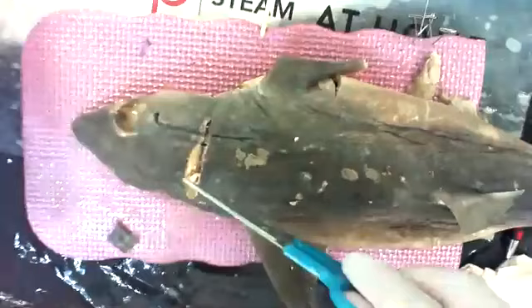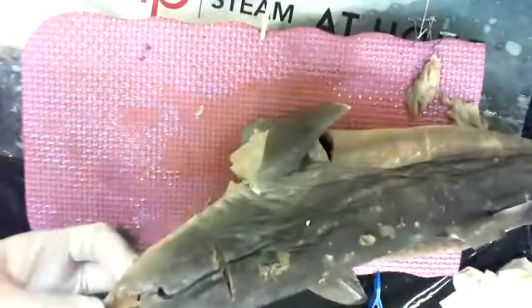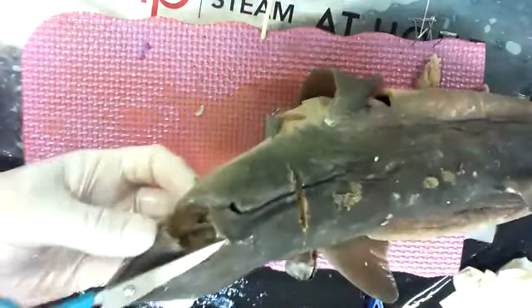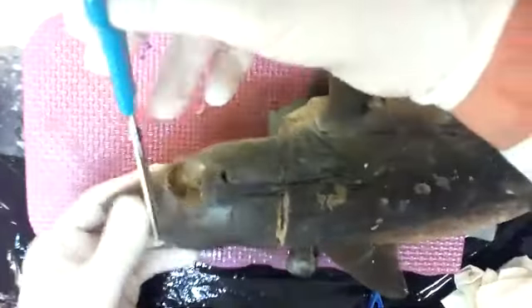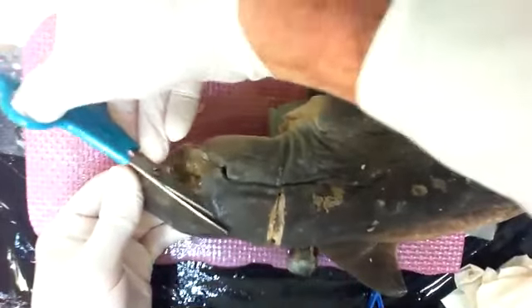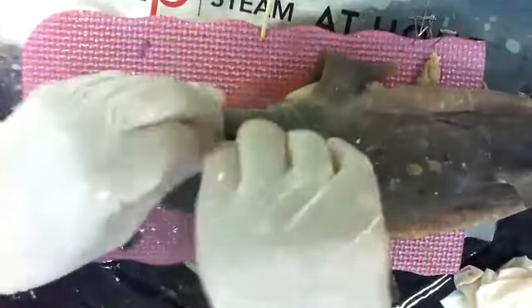So you can actually find those different structures in this by going under the skin and doing it like this. Going in, separating, going in, separating. You find that this is kind of easy because the skin is almost directly attached to the skull. You do it over the muscle and it gets a little sticky sometimes. Oops. Once when I look up and my whole hand's in the image. So I wiggled up here, I just kept separating, and then I can go under the skin, cut, like that, and peel.